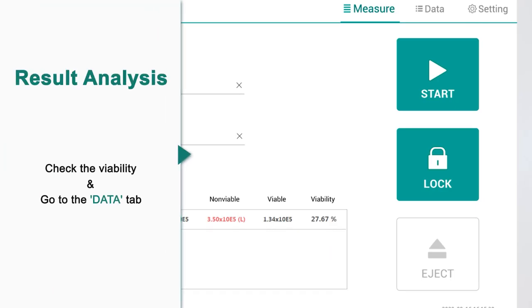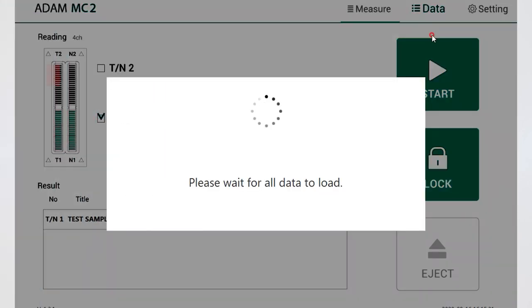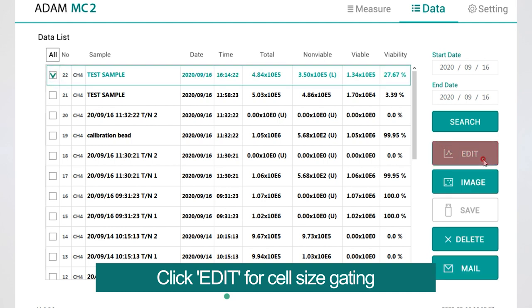Fifth, result analysis. On the data tab, if you select the data in the data list, edit, image, save, mail, and delete icons are activated.